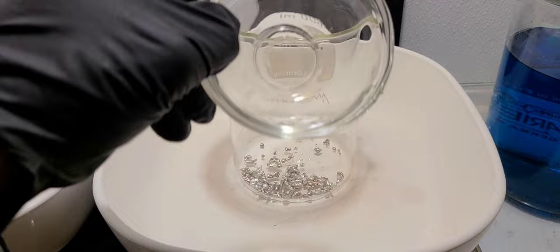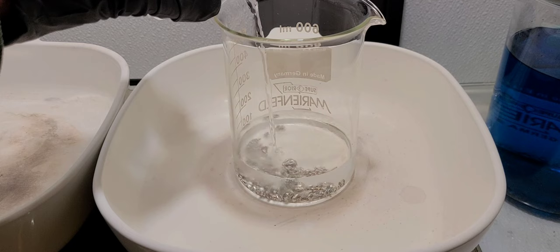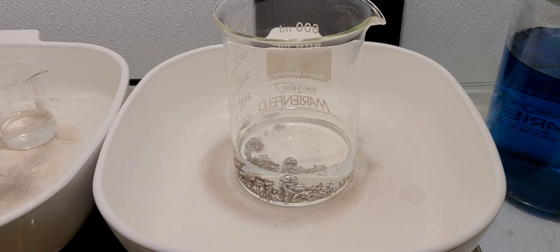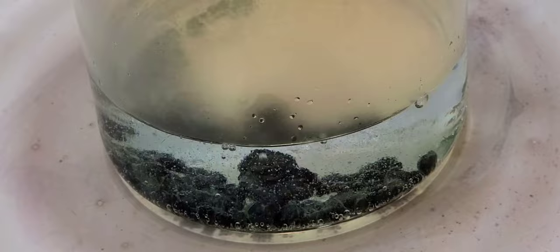We're going to put some distilled water in here and I'm going to add some nitric acid. That nitric acid is going to attack this material and start pulling out those base metals. It's going to pull out the copper, silver, and other things clinging in there.